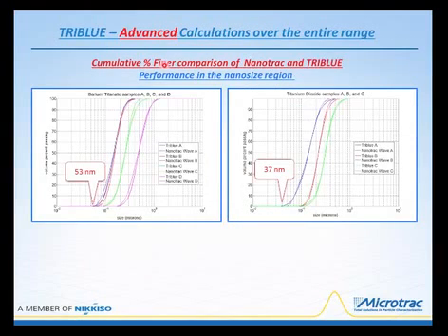I have to thank Dr. Trainer for providing me with this data, and he was able to overlay Tri-Blue and Nanotrac Wave data.